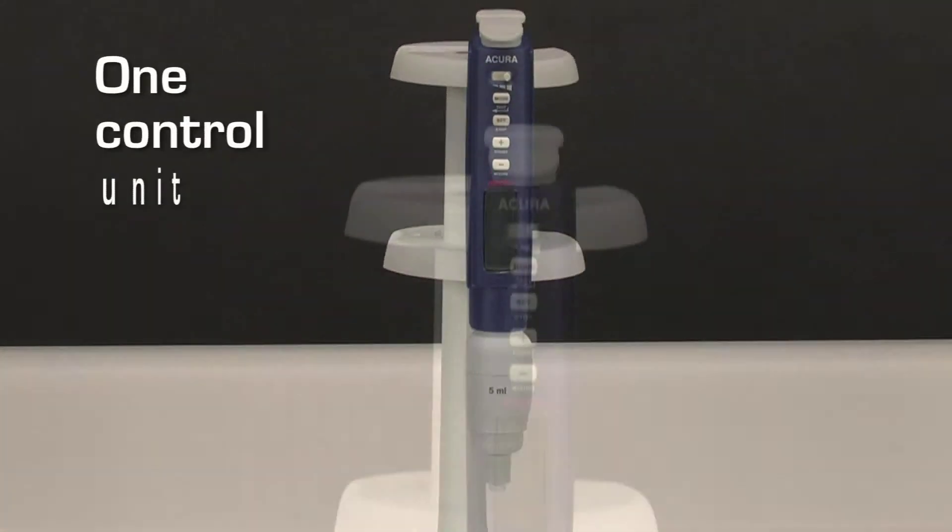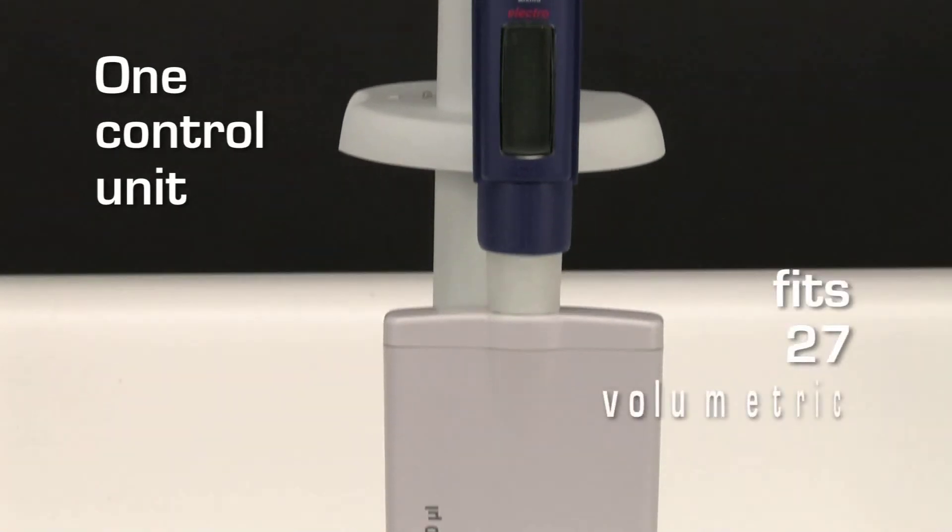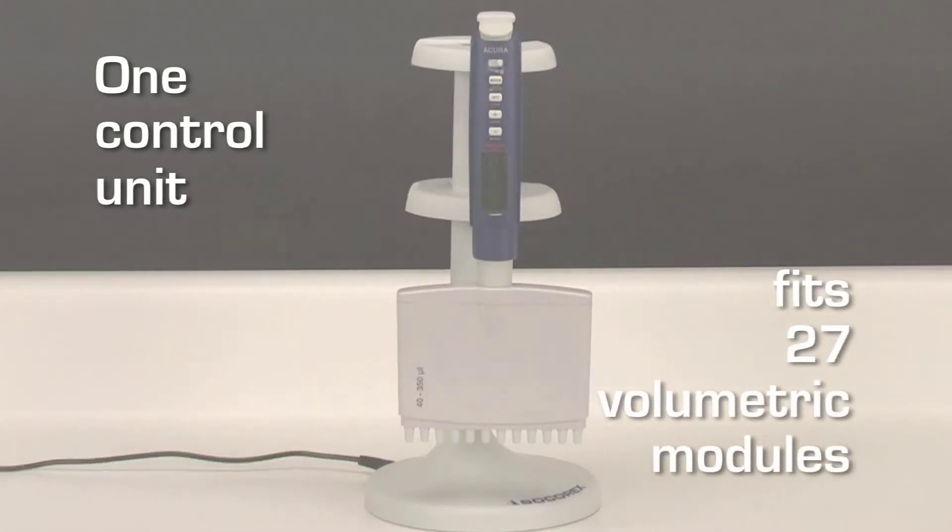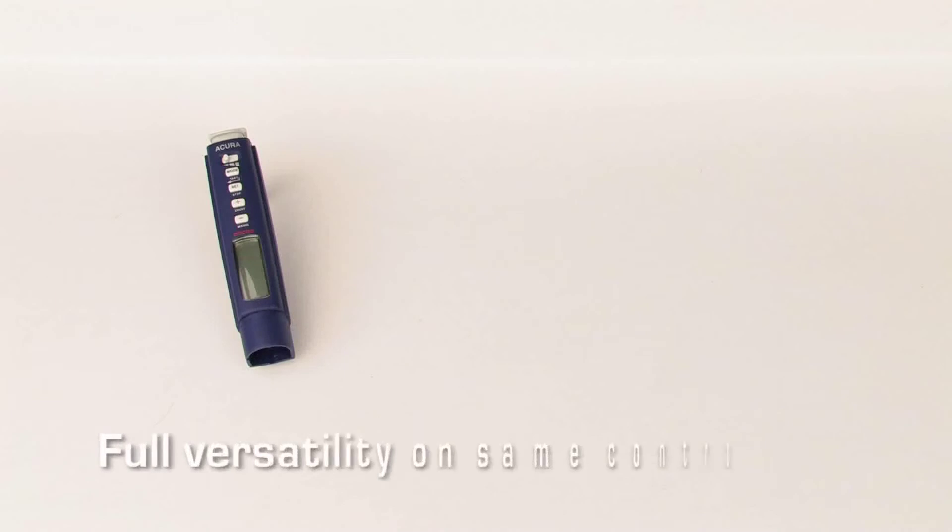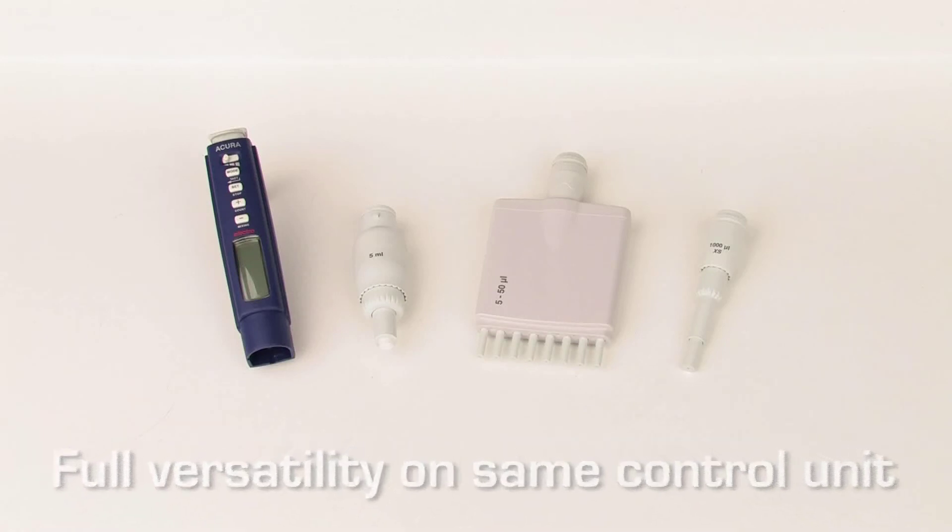Acura Electro offers 27 volumetric modules, which are interchangeable on any control unit. Every volumetric module will fit on every control unit, making electronic pipetting more flexible and affordable for all budgets.